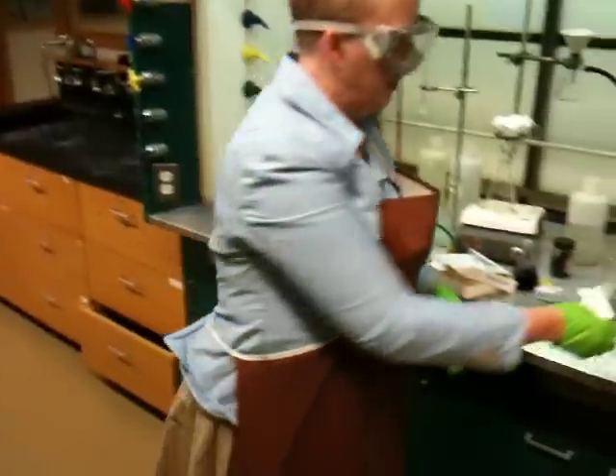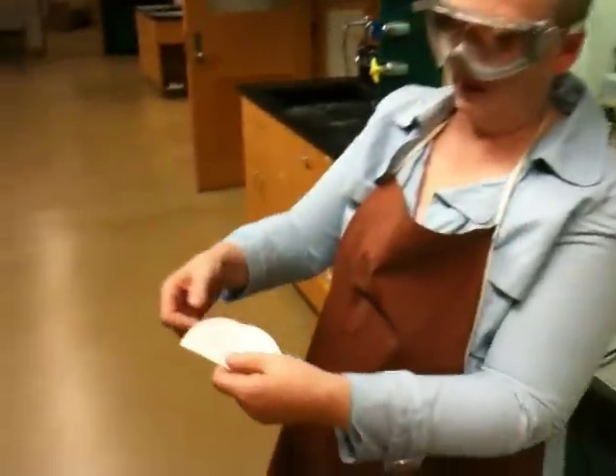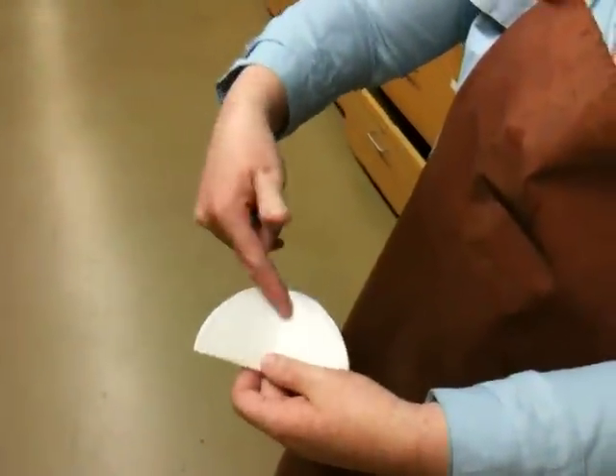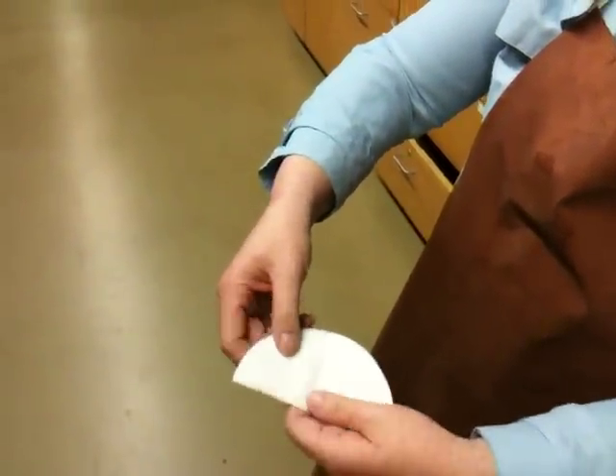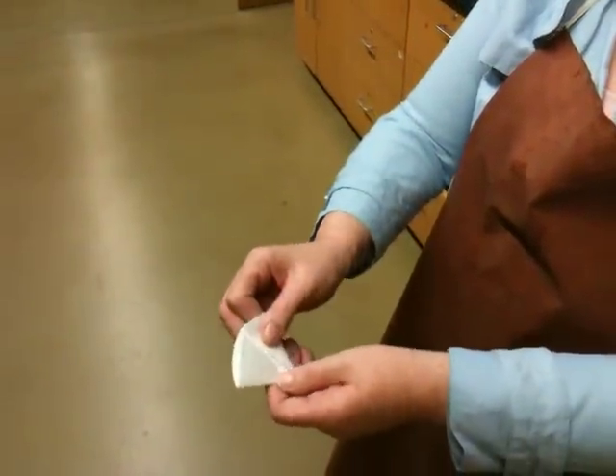And this is the complicated part — I'm going to take my gloves off so you can see it better. This is the part where people get a little bit confused. What you want to do is take each fold and fold it inward. So I'm going to take each fold and fold it inward toward the original crease, like this.